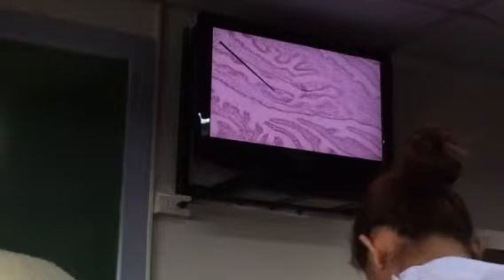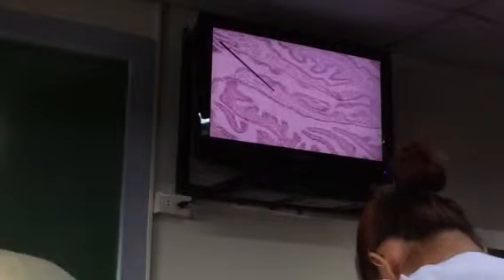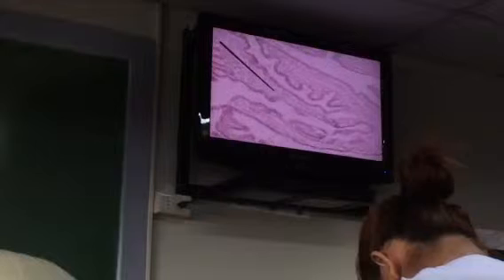As described by Dr. Bravo, it's divided into mucosa, your tunica muscularis, and of course your tunica adventitia. Okay? Now, we're not going to ask you to identify the layers of your muscles, except to be eyeball though. What we'd like you to identify further would be your mucosa. Mucosa, of course, is further made up, again, of lining epithelium in your lamina propria. So this is, of course, lamina propria over here.